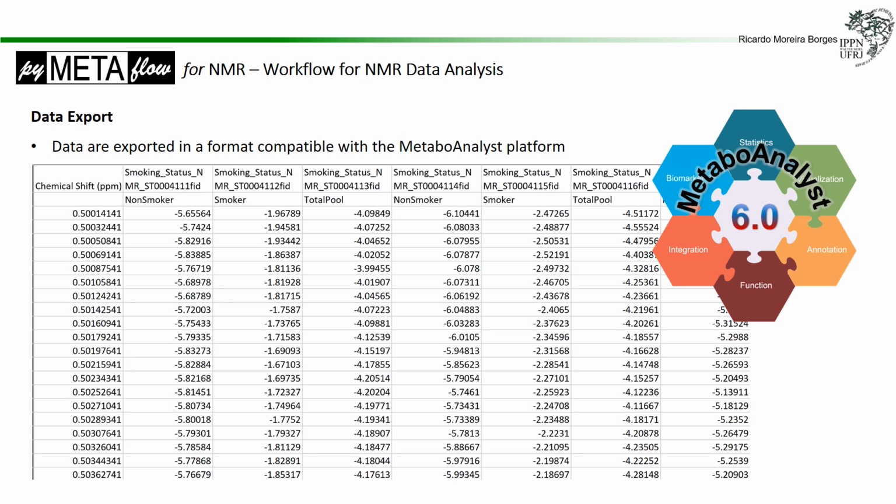But I would say that after the analysis, the alignment is really key for full resolution analysis, and MNova doesn't do that pretty well. So that's why people are used to binning their data. Once your data is not very well aligned, you would go for binning, right?